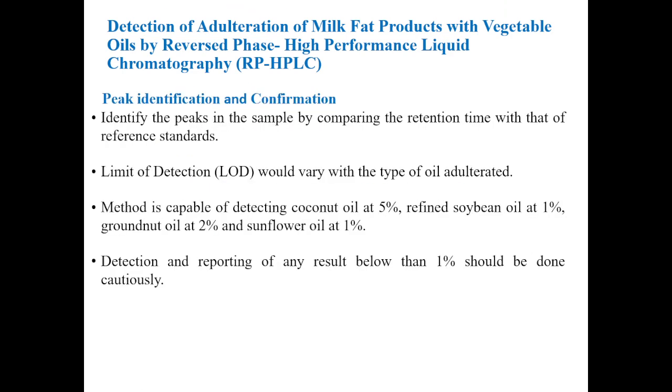Now, how will we identify the peak? We have to run the standards, so that we will be able to know the retention time, and we have to match whatever peaks we are obtaining in our sample with those of the standards. So to identify the peaks, we have to make use of the standards. We have to compare the retention times with those of the reference standards we are using.